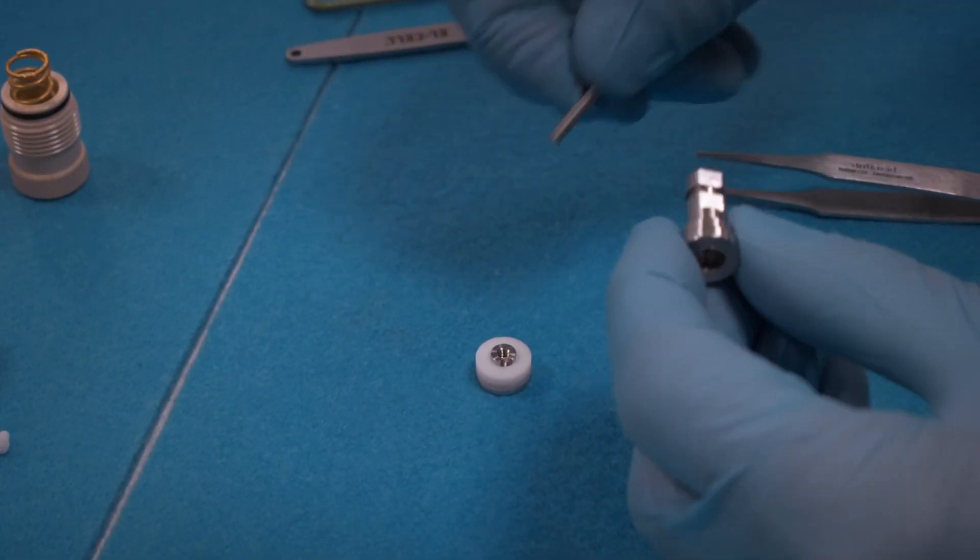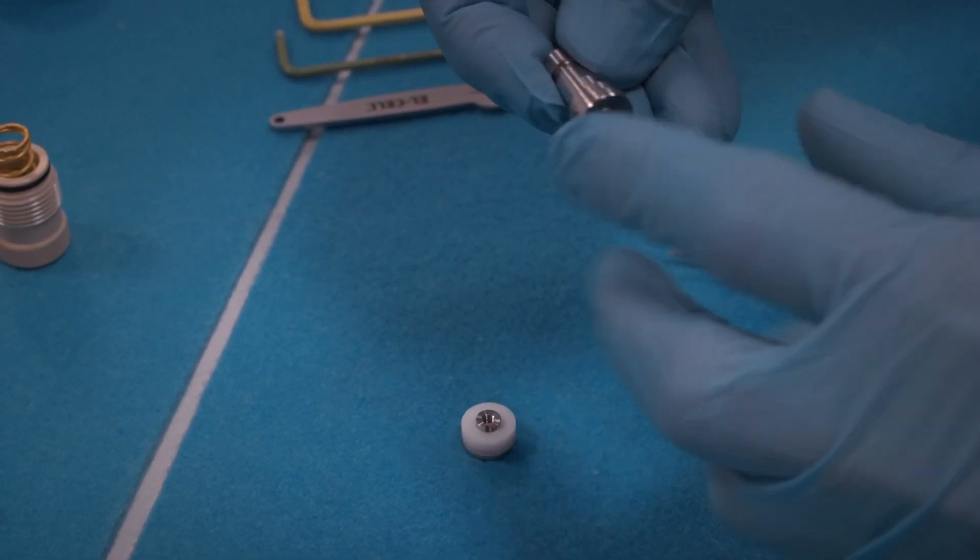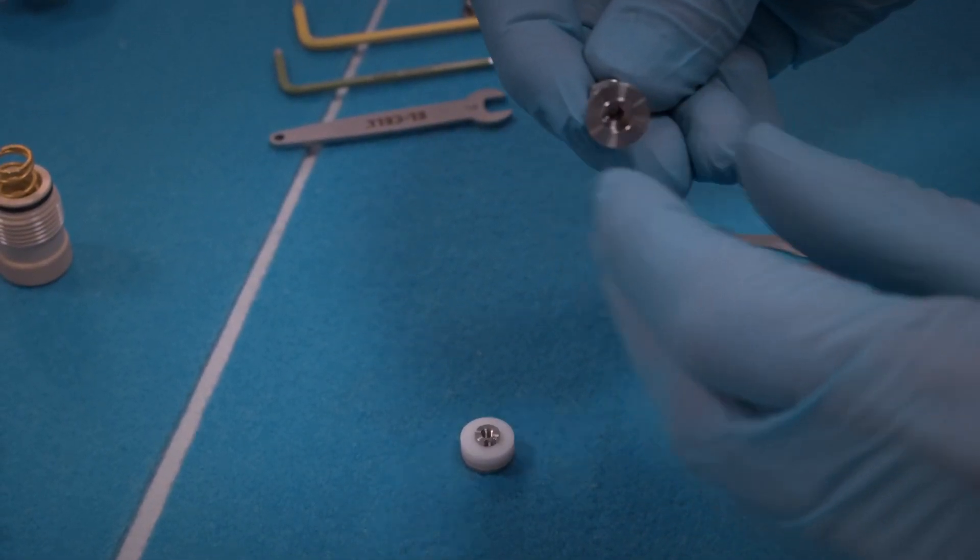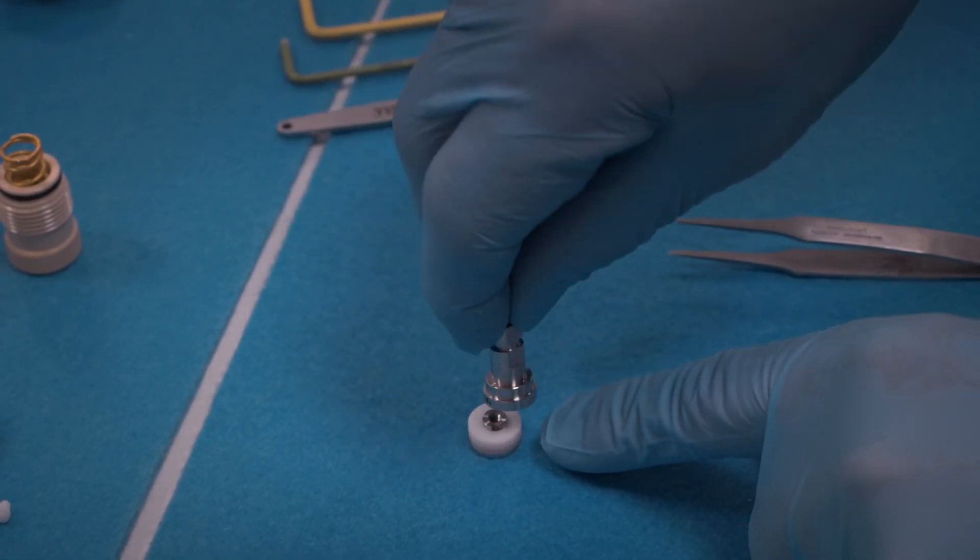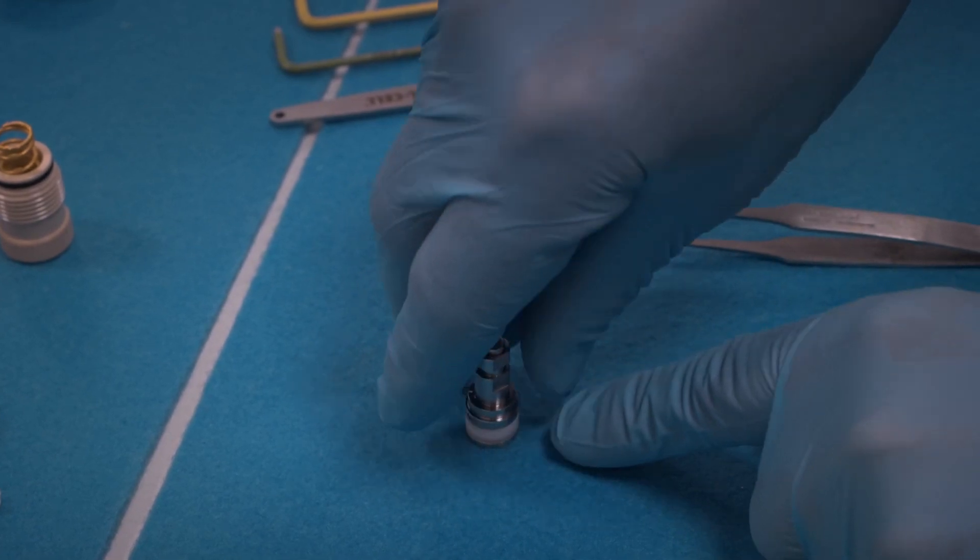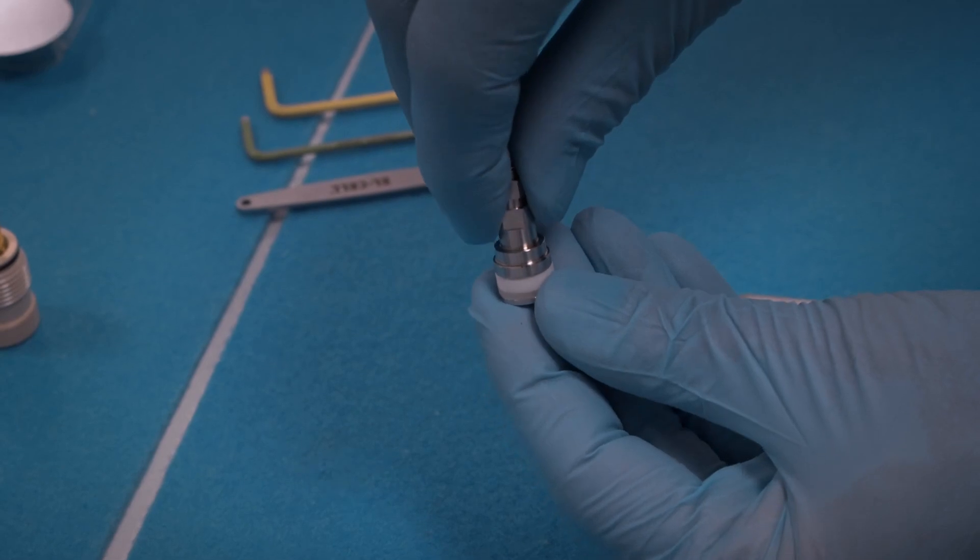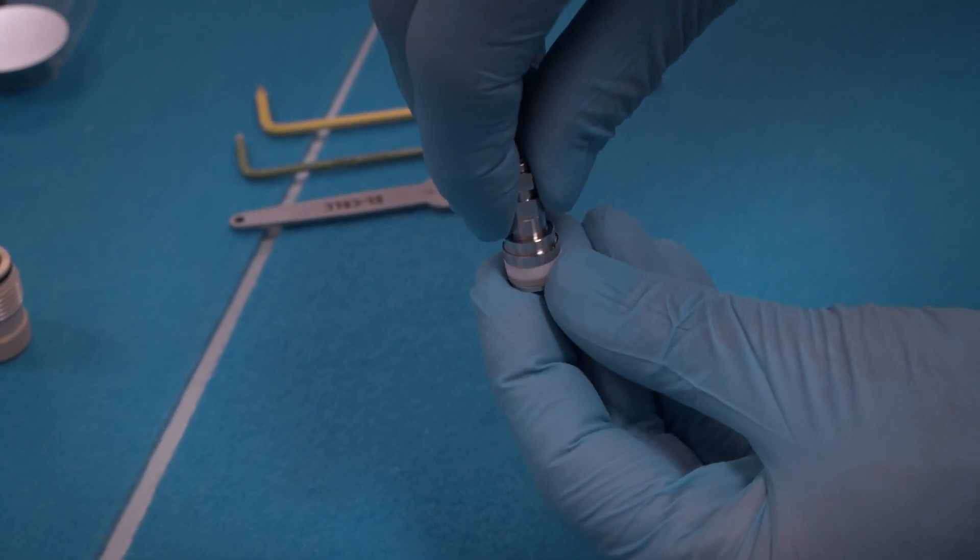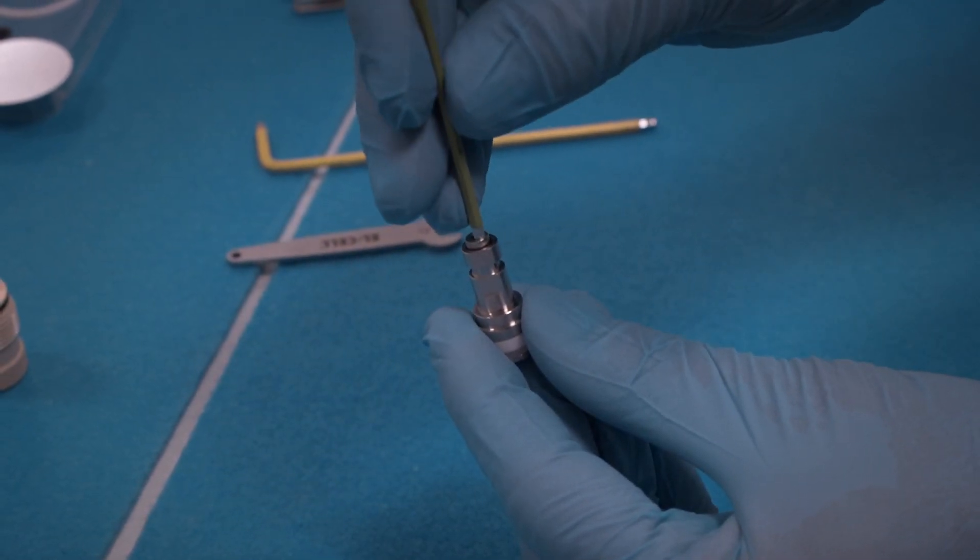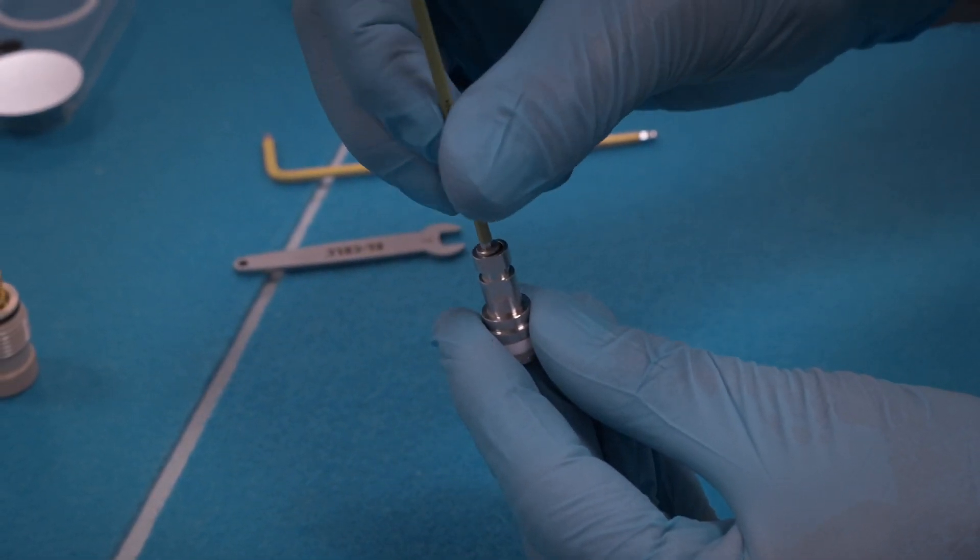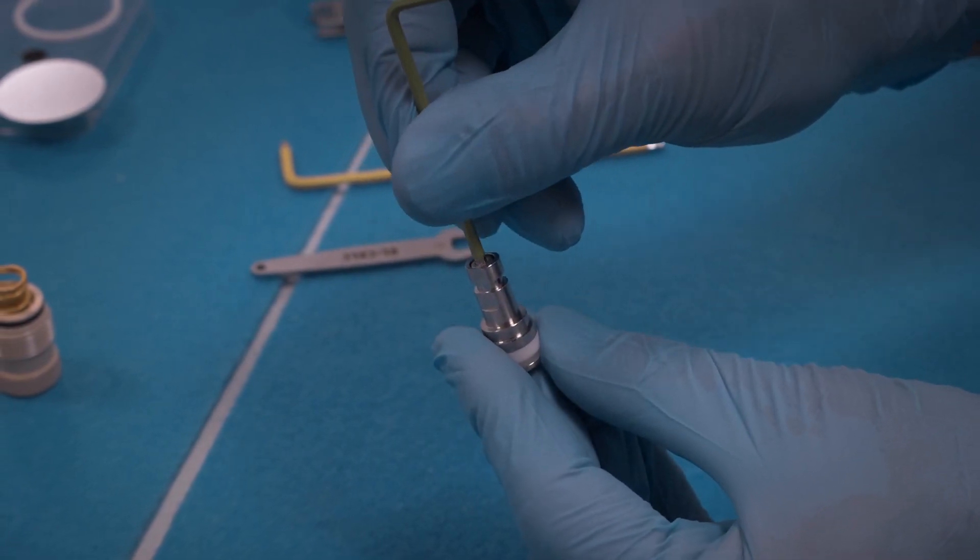Attach the lower part of the piston with the set screw inserted. Make sure that the set screw is aligned with the notch in the upper part. By turning, ensure the two parts are properly in position, then only gently tighten the screw at this point.